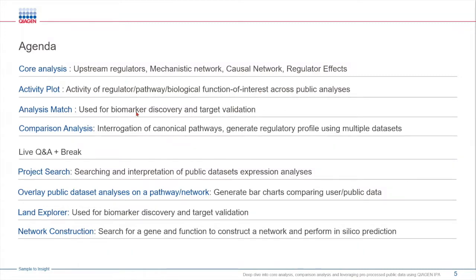Next we will look at analysis match feature to discover public data sets with similar or opposite biological results compared to yours. This will help you get new insights into your data.